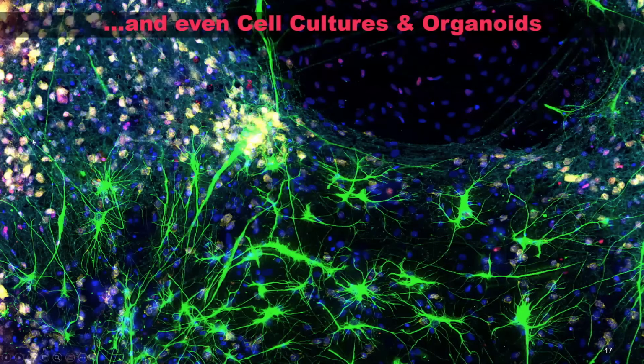The cells did not wash off. We were able to look at this culture with, I think, 36 different antibodies, seeing things that we had never really seen before. See here glia, see neurons, see all kinds of connectivity between different parts of the culture that we had never really understood. We don't even understand them yet, but we've never even seen them before. So the application range of CODEX is essentially anything you can image, you can do your CODEX experiment with.